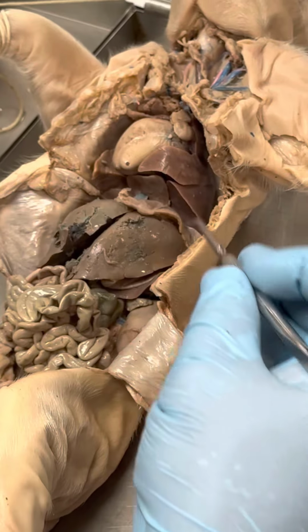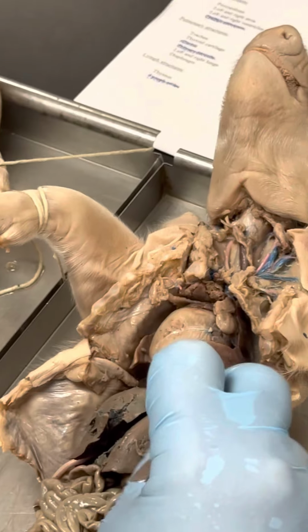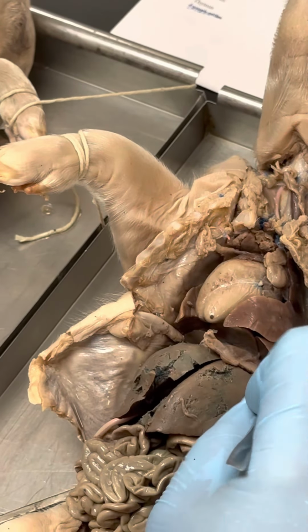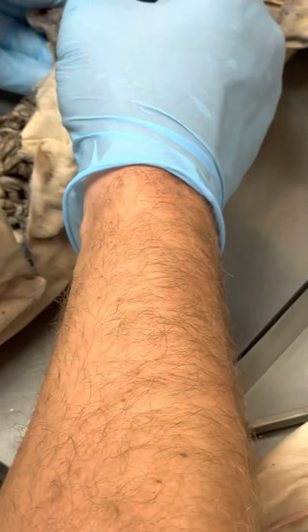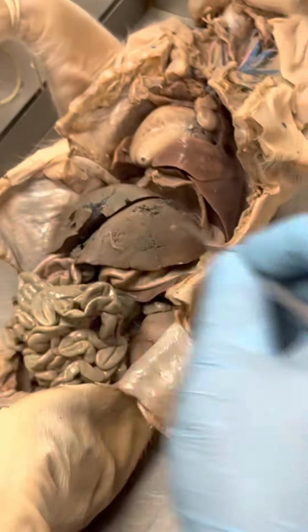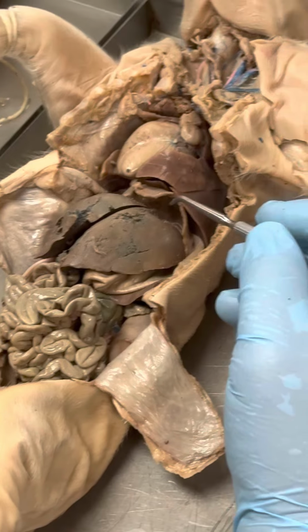Next, intercostal arteries and veins, intercostal in between the ribs. So if I poke in between the ribs, those are your intercostals. Intercostals. Intercostals. I was watching the cameras move.